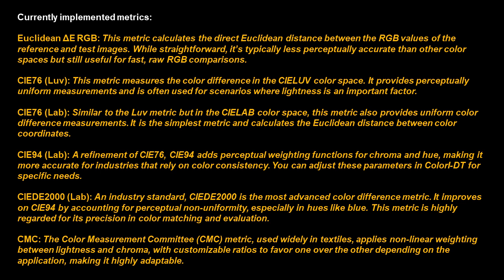We have a version of the CIE94 Lab metric that is a refinement of the CIE76. It adds perceptual weighting functions for chroma and hue, making it more accurate for industries that rely on color consistencies. You can obviously adjust these parameters in ColorI DT.